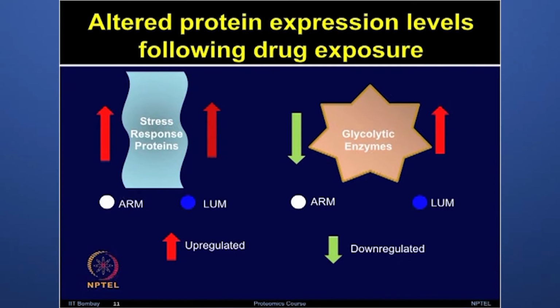However, there are certain proteins such as the stress responsive proteins like heat shock proteins which were commonly induced due to either of these drug treatments, which looks like a general stress response as compared to any unique response to the given drugs.